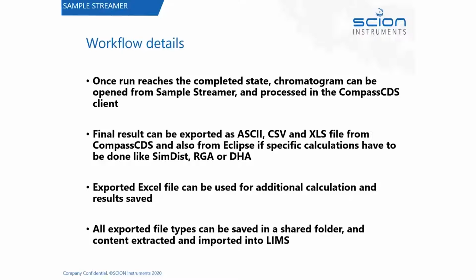All of the exported files can be saved and reviewed at a later date. So you don't have any worries that, well, once I've completed this, the data file or the export is lost. No, you still save all of that data, which for a compliant laboratory becomes very important.